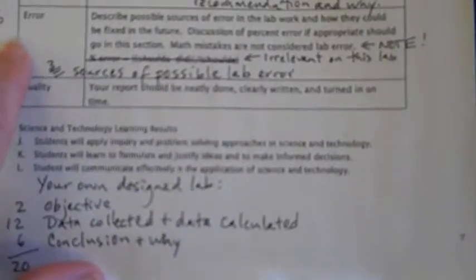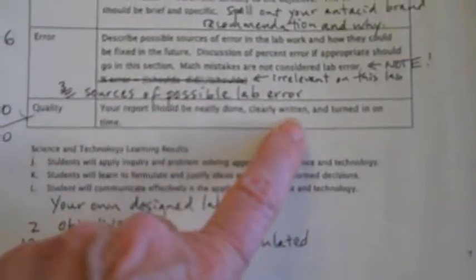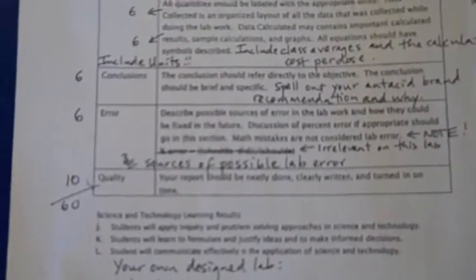Also important in every lab is possible sources of error. You need to list 3 possible sources of error. Where might you have gone wrong? Maybe you didn't grind your tablets into a fine enough powder. Maybe you didn't record your hydrochloric acid amount right. Anyway, you'll hear some other sources of error.